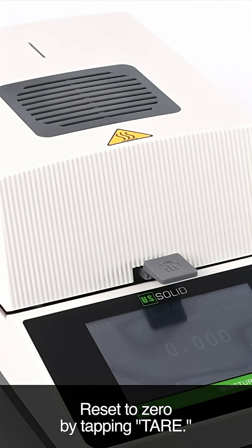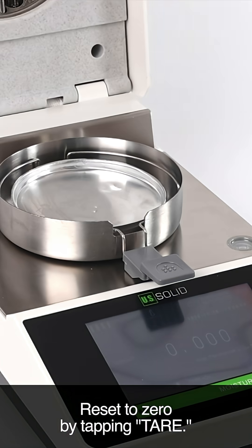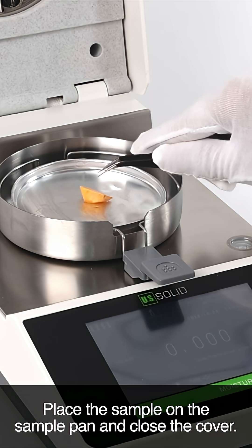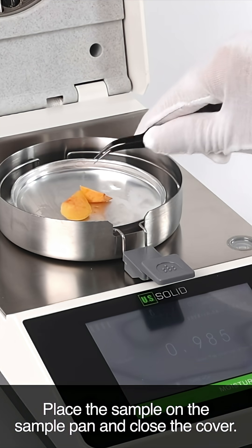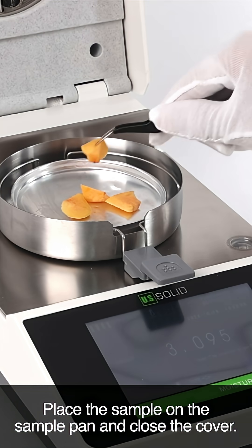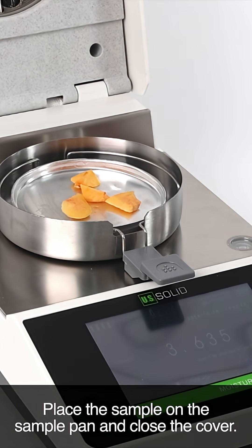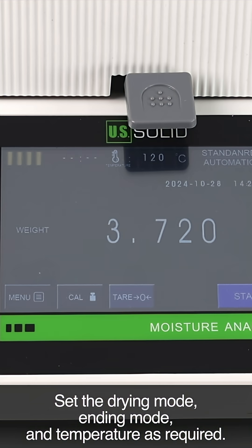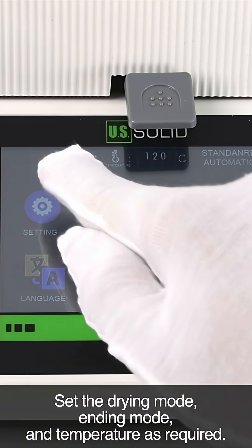Reset to zero by tapping TARE. Place the sample on the sample pan and close the cover. Set the drying mode, ending mode, and temperature as required.